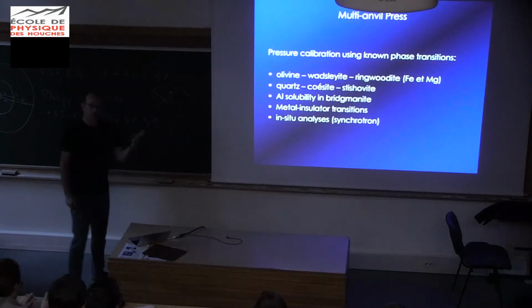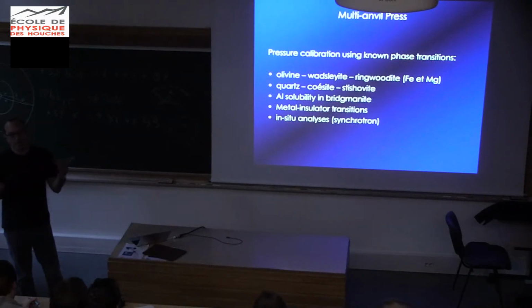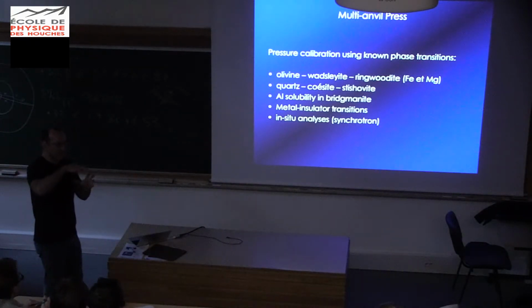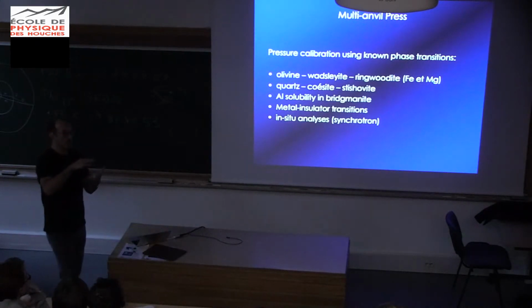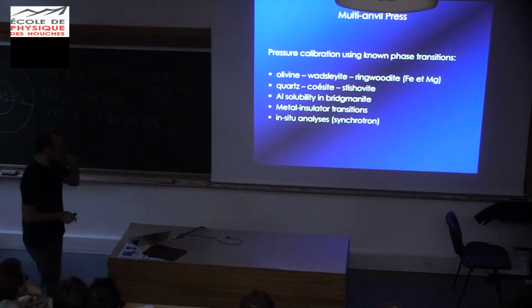So now pressure calibration, same thing. Here you can't assume that you have pressure divided by surface with a little bit of friction. That's not going to work because the surface is a funky surface. It's deforming, and there's a lot of friction on the primary anvils themselves that transform the uniaxial pressure into a 6-axis pressure. I mean a 3-axis pressure, right?